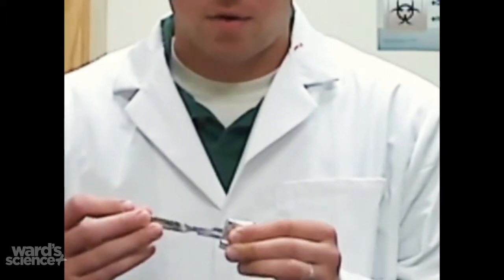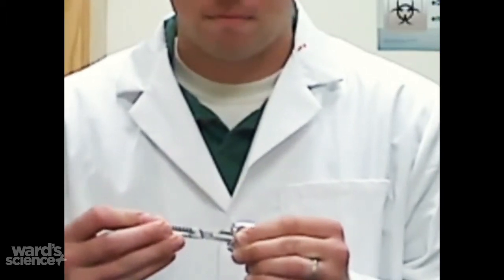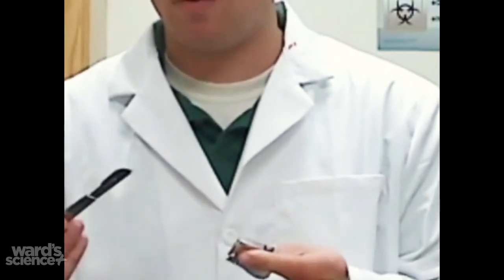Next, you're going to take the scalpel blade. You're going to hold it with your two fingers and you're going to insert the handle of the blade. It clicks right in nice. Now you can remove the scalpel from the packaging and dispose of the foil.